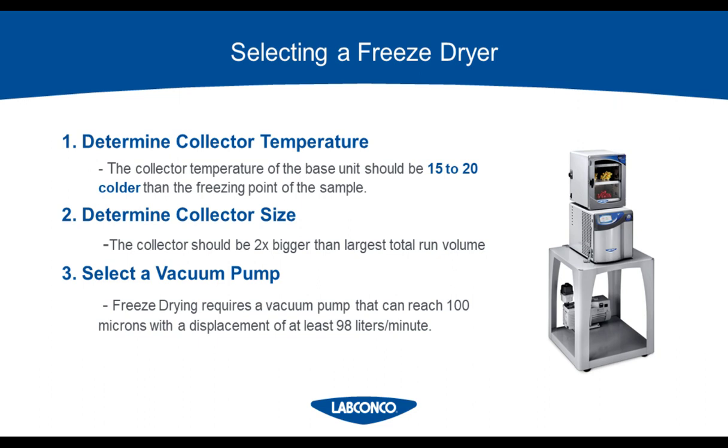Other than knowing what kinds of solvents you'll be using, you will also want to determine the collector temperature you need, keeping in mind that the temperature should be 15 to 20 degrees colder than the freezing point of your samples. Freeze dryers typically come in collector temperatures of -50, -84, and -105 degrees Celsius.